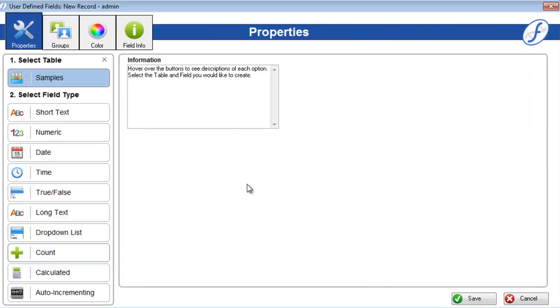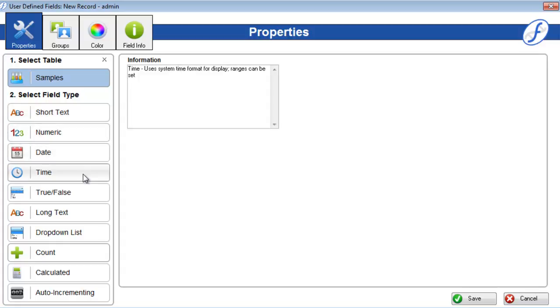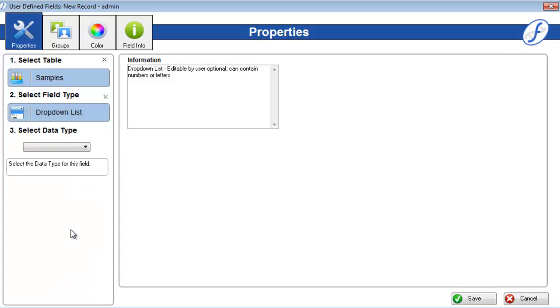Again, hover over each field type to see a little info about it to the right. Some field types, like drop-down list, will ask for a data type after you select them. Simply open the drop-down and choose one to move on to the next step of the process.